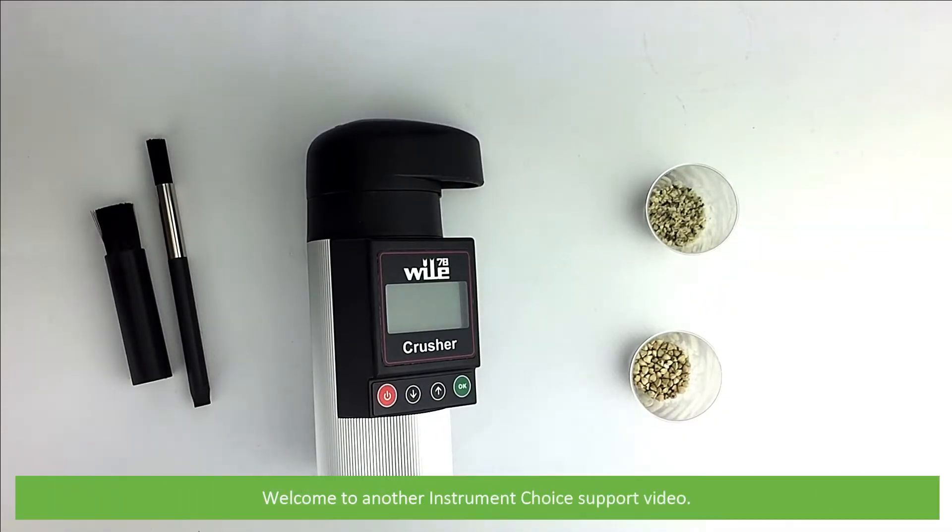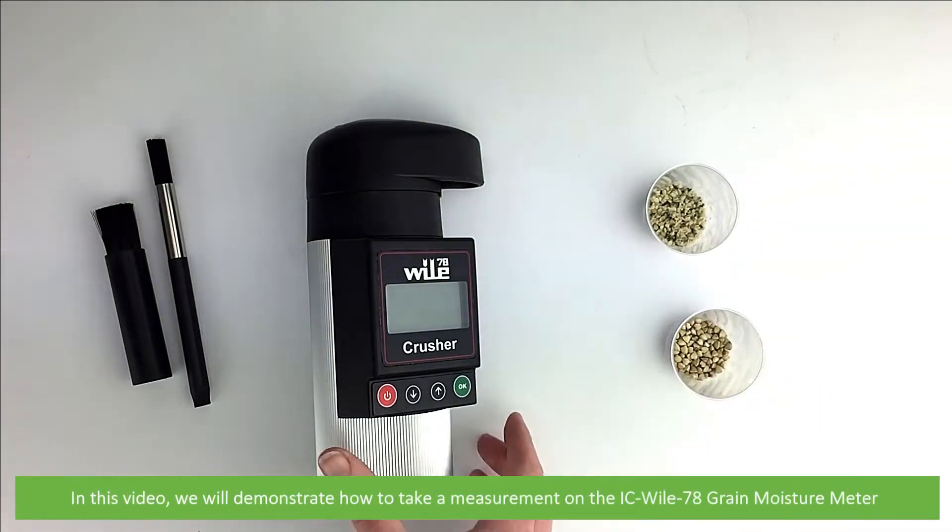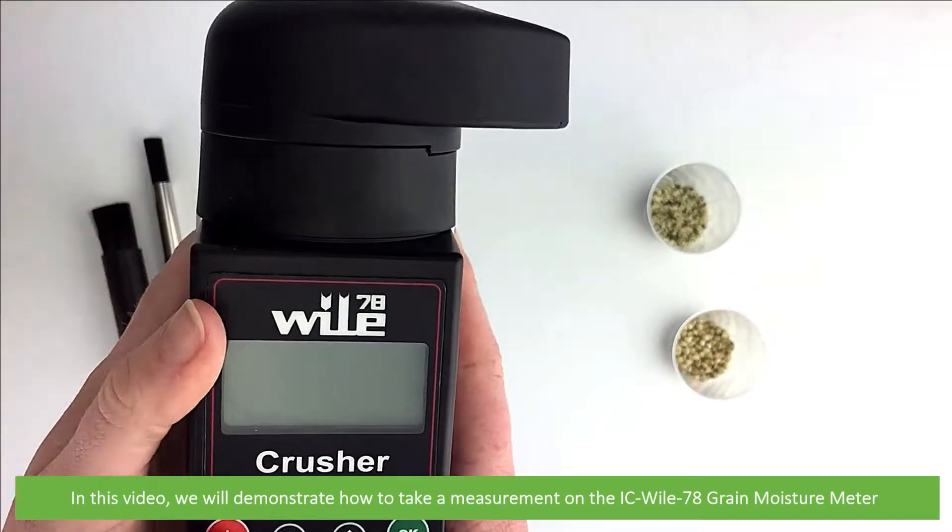Hi and welcome to another Instrument Choice support video. In this video we'll demonstrate how to take a measurement on the IC Wiley 78 grain moisture meter.